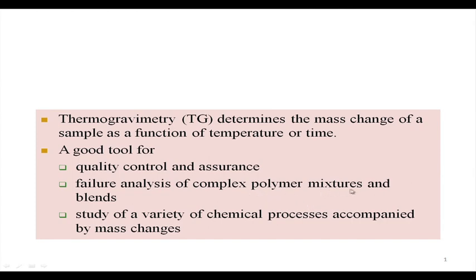So, these polymer mixtures and their blends, and how good they are. For this complex species we can go for the thermal stability analysis, and the failure analysis of these polymer mixtures and the blends will discard them for their useful use.